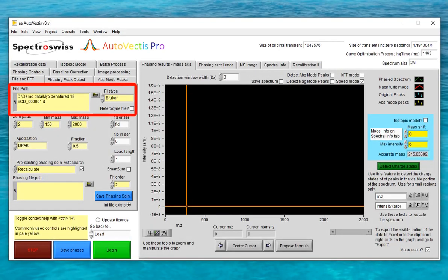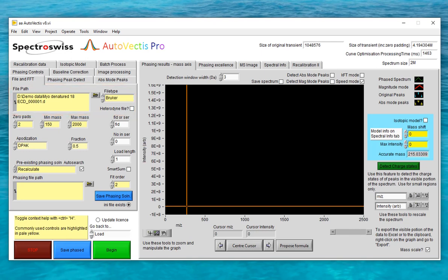We'll start the demo by processing this Bruker ICR file, but you'll see later that the process for an Orbitrap file is almost identical. In Autovectus, this is the control that you use to change which of the processing routes you're using. Currently I have it set to Recalculate, and in order to start the processing down that route I need to click the begin button.